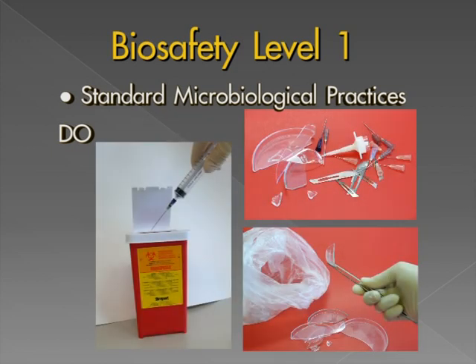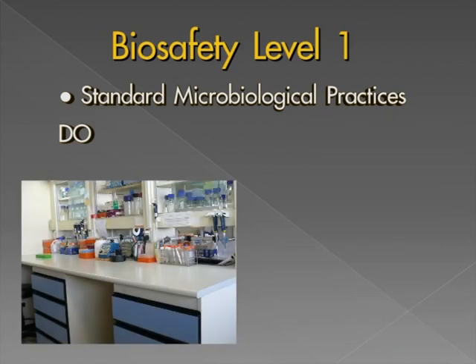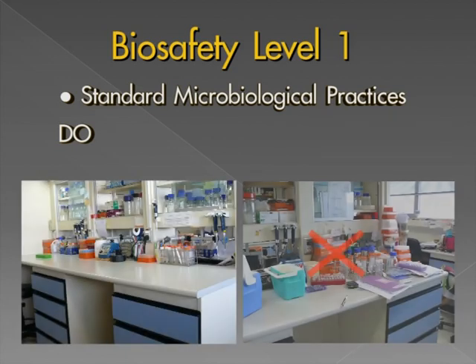Procedures for the safe handling of sharps, such as needles, scalpels, pipettes, and broken glassware, must be in place. Decontaminate or sterilize all cultures, stocks, and other potentially infectious materials before disposal. Keep the laboratory neat and organized.